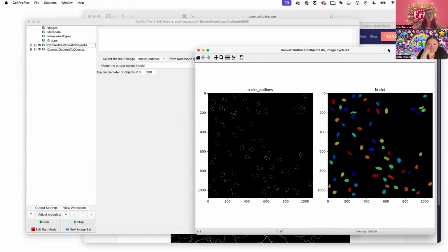My nuclei. Nuclei are generally the easiest object, the easiest identification task for compartments within a cell, because they're generally pretty round and fairly separated, since the rest of the cell keeps them from bumping up next to each other when cells are next to each other. So this is a pretty easy task, but really lovely that it just kind of works.